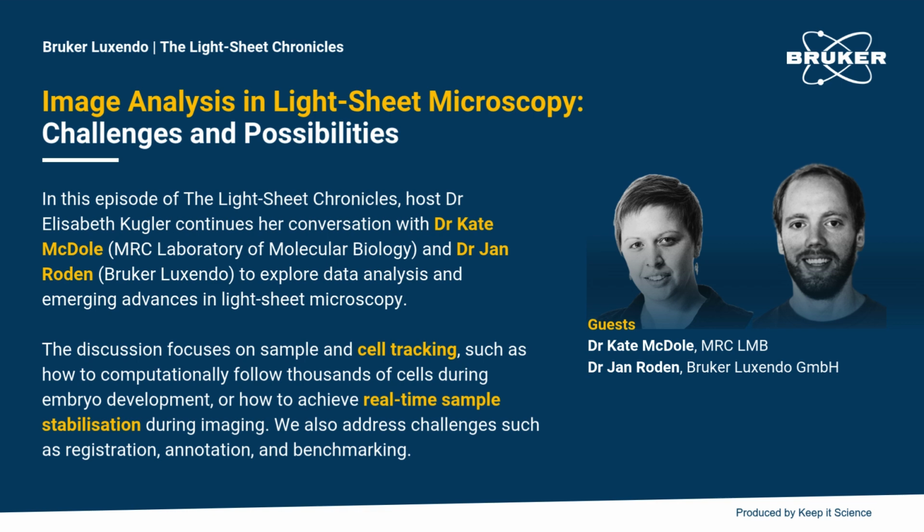So in most cases, we also have a ubiquitous channel. If we have one channel that's very mosaic, we have another channel that is ubiquitous, and so we can use that as a reference. In some cases, though, if you just have a very sparse label, you're either going to have to do it manually somehow, or just accept the fact that you're not going to get both views fused together.